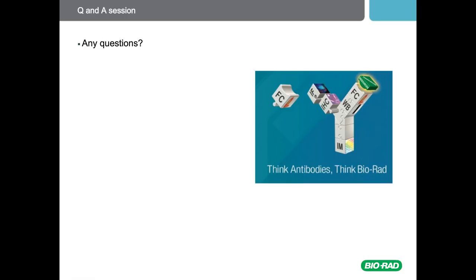So over to the next question. I want to do intracellular cytokine staining. Are there any specific steps I need to include in addition to the basic intracellular staining protocol? Well, for specialized intracellular staining, such as cytokine or chemokine staining, there's a few extra steps and precautions that have to be taken. When you are using blood as a sample, you have to make sure you collect the blood in the appropriate anticoagulant. EDTA is not a suitable anticoagulant when looking at intracellular cytokines.